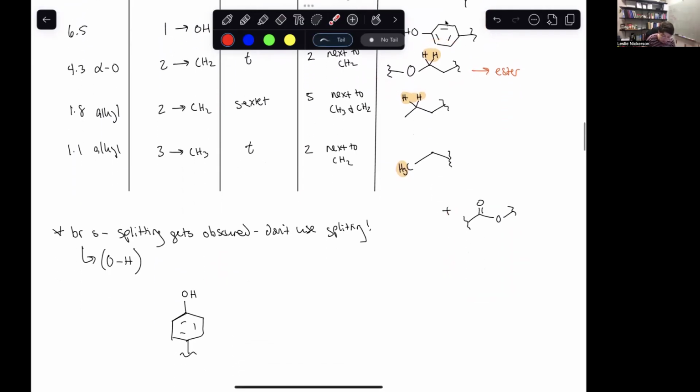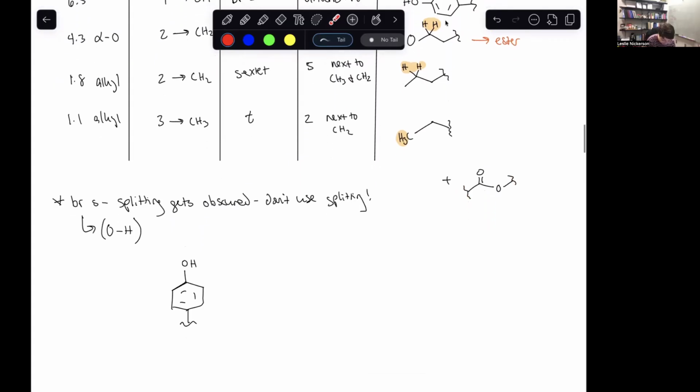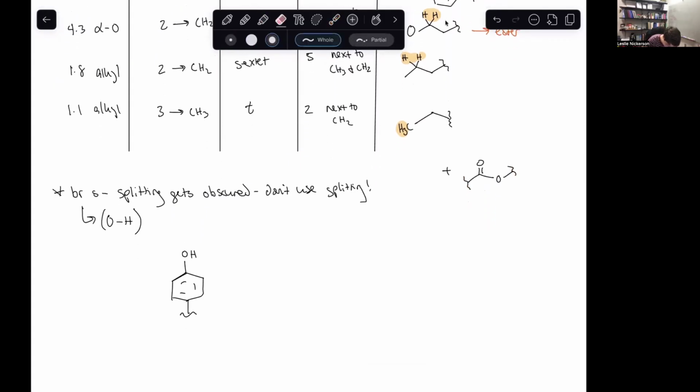Okay, so if I think about this oxygen is probably going to be this oxygen, I can think about connecting either side of that to my benzene ring and just seeing what that looks like.